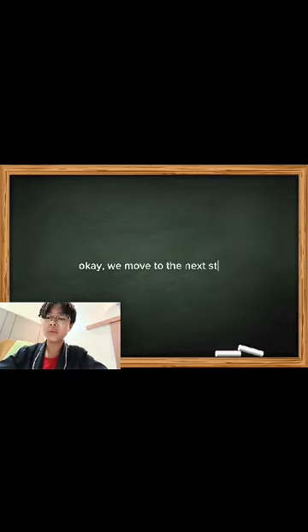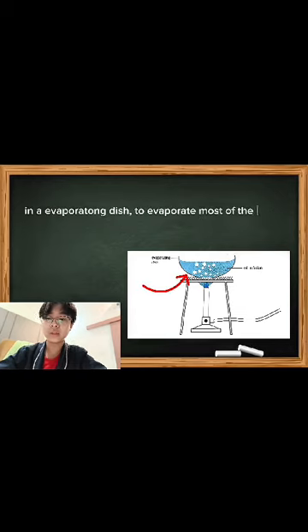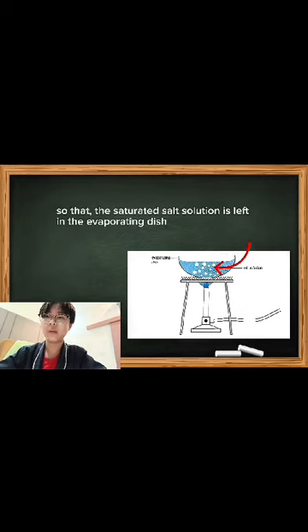Okay, we move to the next step. The next step is we need to heat the filtrate gently. We need to heat the filtrate gently in an evaporating dish to evaporate most of the water from the filtrate, so that a saturated salt solution is left in the evaporating dish.